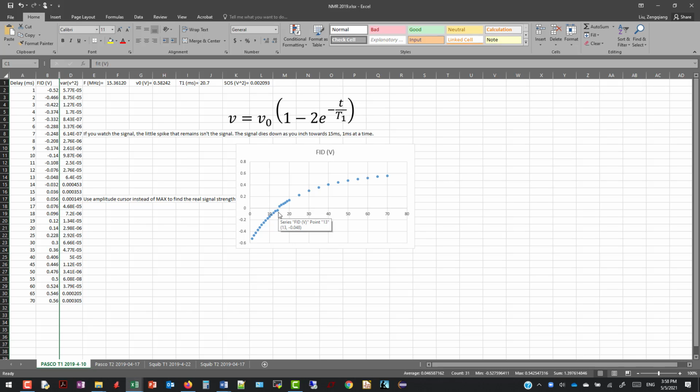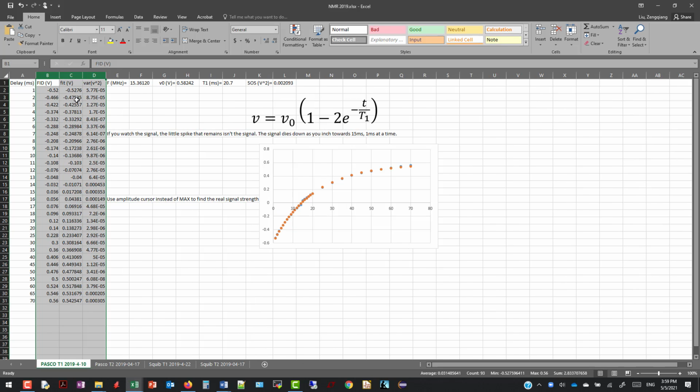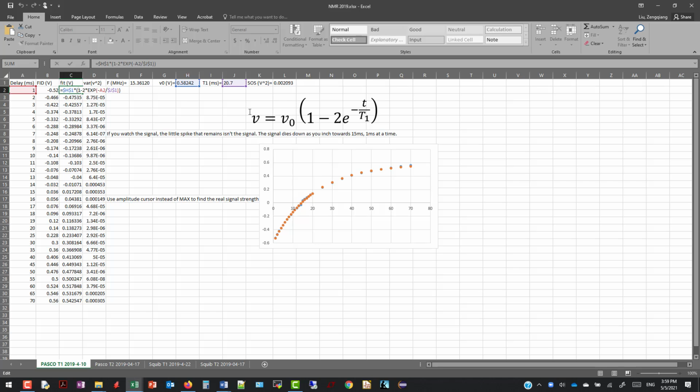So we could actually ignore some of these if you want, such as these values, or even maybe more values, because they have higher relative uncertainty because they're lower magnitude in voltage, and our scope is not very good at low voltages. So this function is just going to be typed in literally right here. Sorry, not this one. Let's unhide. So you type in this function literally.